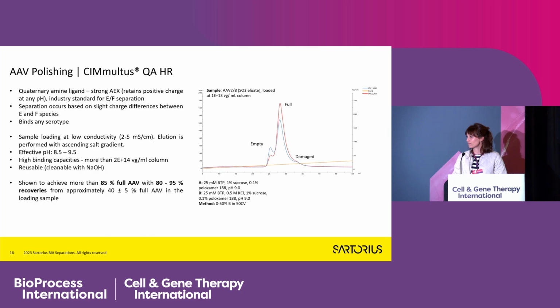There were some talks, I believe, at ASGCT showing that this is connected with deamidation. So it might be the pH or temperature earlier in the process affecting the size of this peak. And we definitely want to separate this out so we don't capture it together with the full elution.